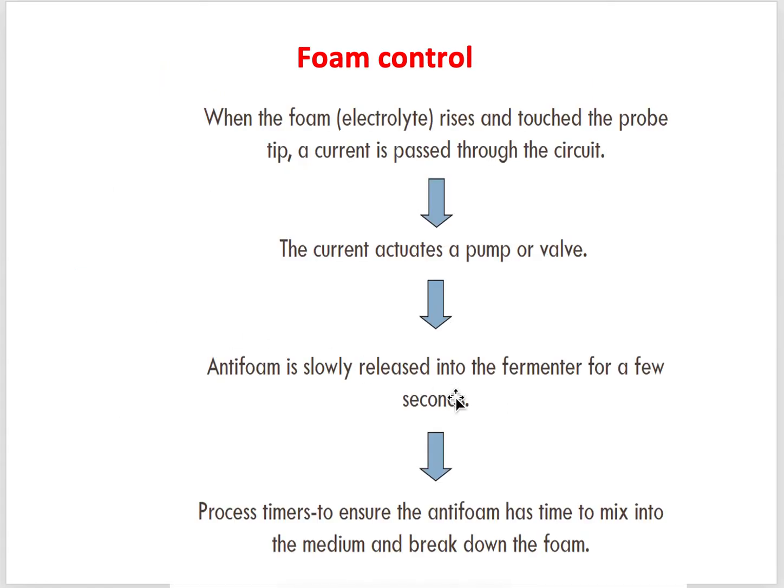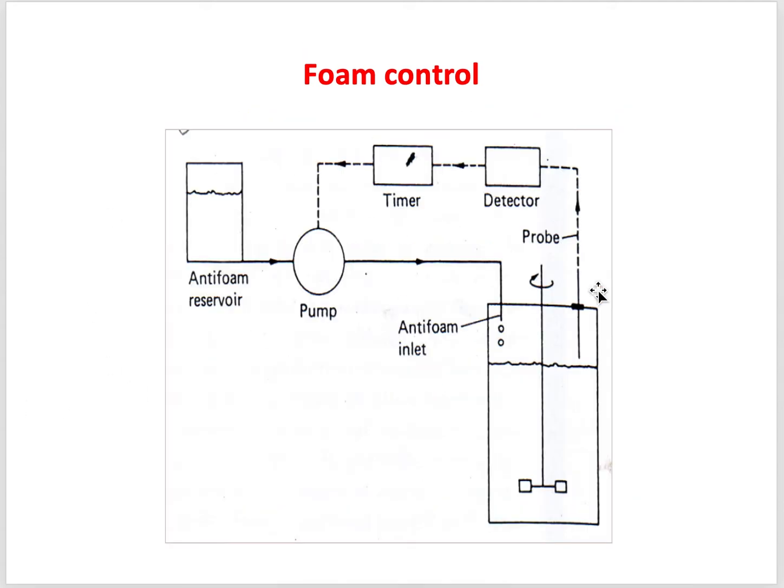Now the foam controlling system. In most fermenters where foaming is a problem, foam control is a must. How the foam control system works is a step by step process, and the same process is depicted by this diagram. Say this is the fermenter.